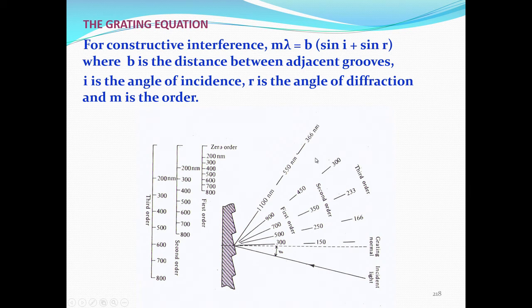There has been a lot of work done in reducing the higher order radiations coming from a grating, so that the wavelength accuracy is optimum. If you are measuring around 1100, you will not be measuring 550 in general, but it will serve as a stray radiation which will result in a slight aberration.